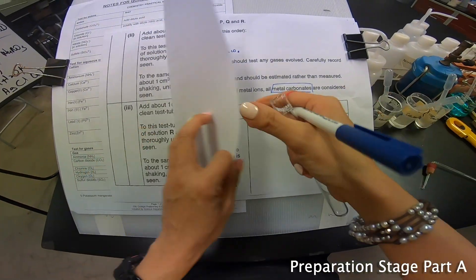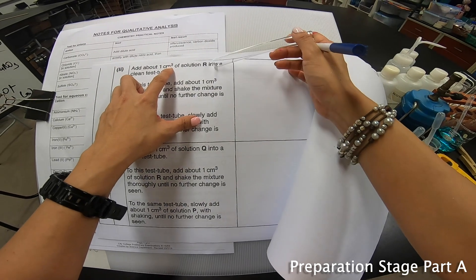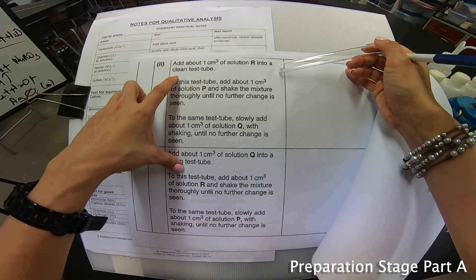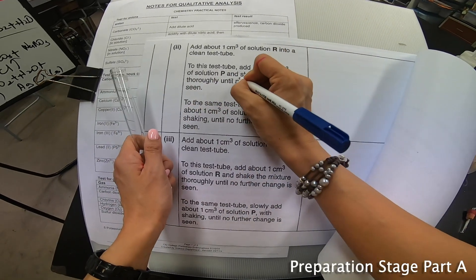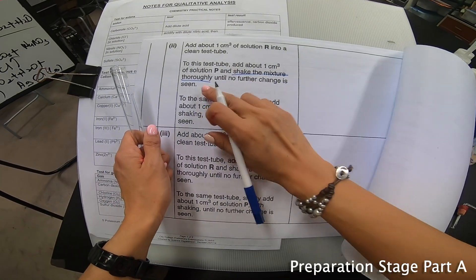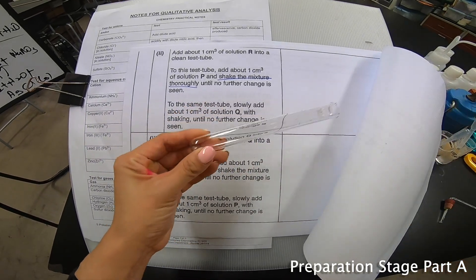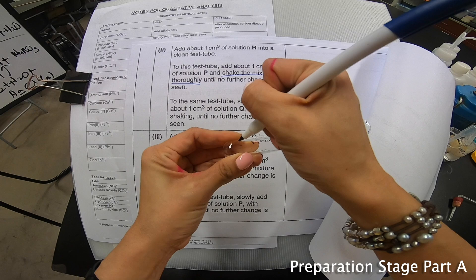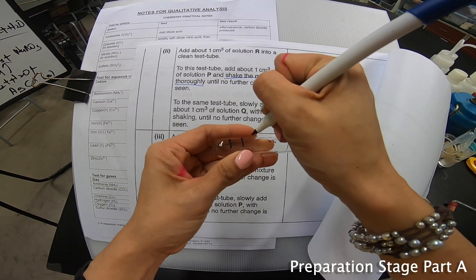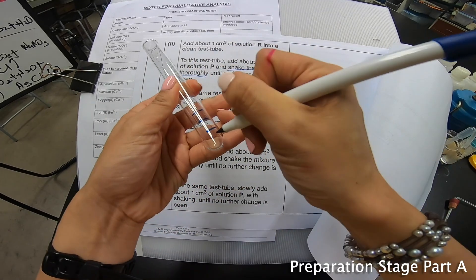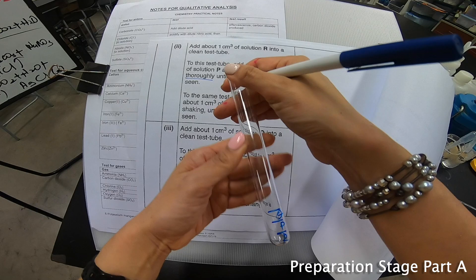Now, remember, all these are estimated. This is A part 1. I make sure that I label A part 1. Label nicely and let's put it back. Let's move on to the second page then. Now, the second page goes on to say that add about 1 cm³ of R into a clean test tube. And then to this test tube, add about 1 cm³ of solution P. Shake the mixture thoroughly until no further change is seen. And to the same test tube, add about 1 cm³ of solution Q.